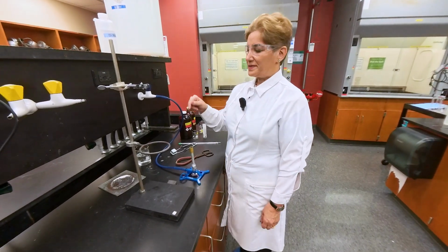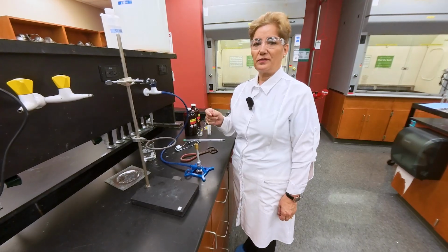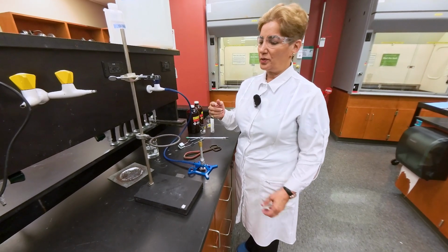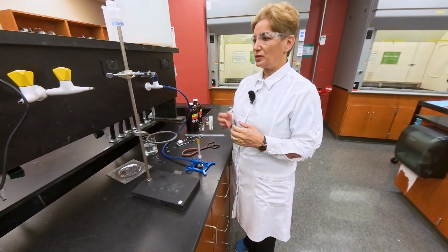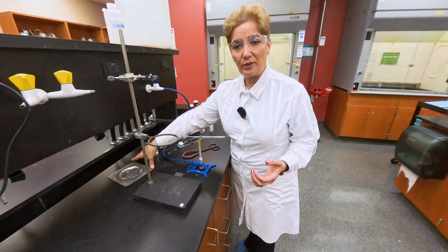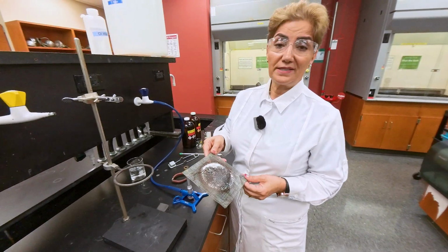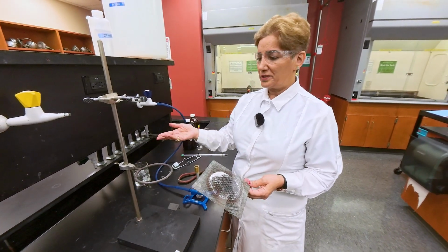Part 4 of experiment 1, we are going to measure the boiling point for a liquid. Boiling point is the temperature where the liquid changes to gas. To measure the boiling point, we are going to use a hot water bath. So the sample we are measuring cannot have a boiling point higher than 100 degrees Celsius, because that's the highest temperature we can get with water.